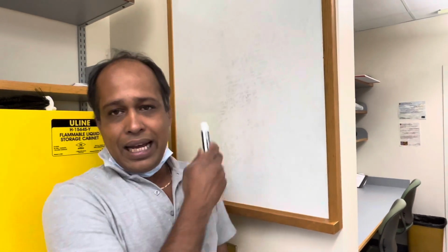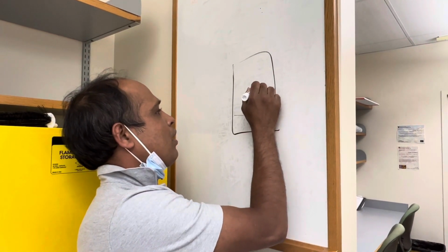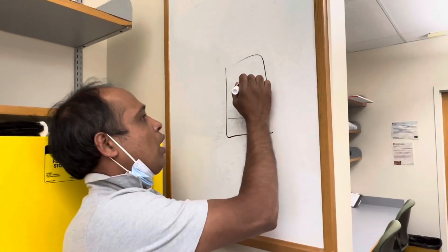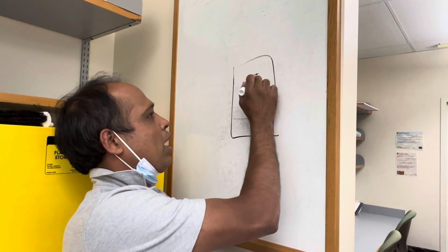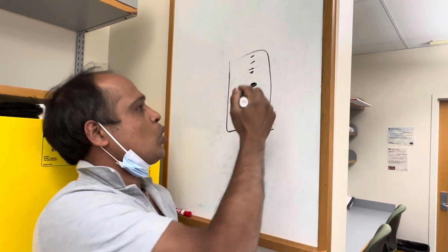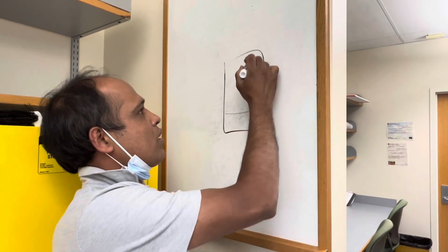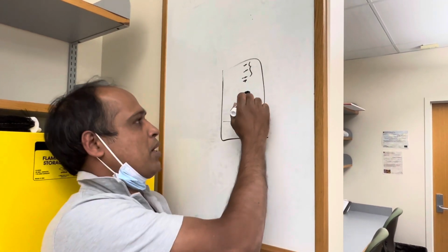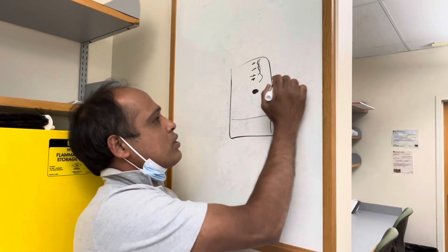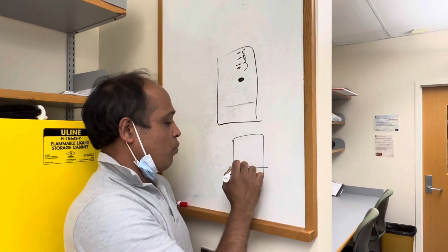Yeah, it's always confusing, as I already explained before. If you think, after checking all kinds of solvent and TLC, that you have this kind of impurity, and you're running the solvent and you see, maybe with hexane for a longer time, that it is coming out but your compound is not, so just run those out, wash those out, and once you get those fractions, do the TLC with your crude material, okay?